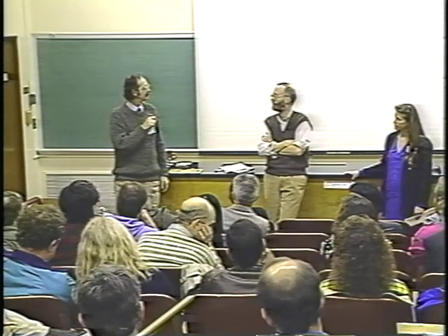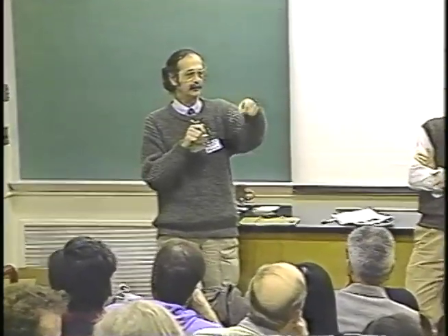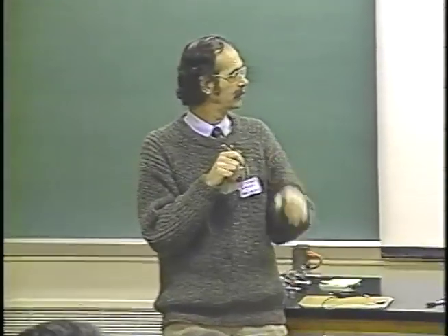Be able to recognize very close details. I'm sorry, I may not have stated that very well. Well, you have a stereo pair, and you have to solve the correspondence problem. You have to know that this particle in this image is the same as that particle in that image, and then your brain will properly position that in the Z direction, or the computer will properly position it.